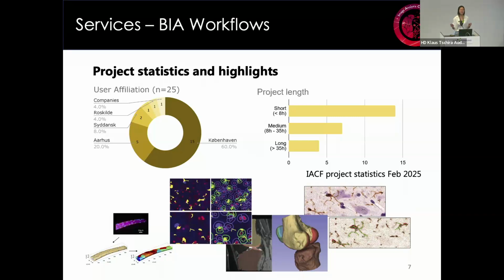So we find that somewhere in between is where we can actually provide image analysis as a service quite meaningfully. So that's things like tricky data sets where your out-of-the-box solutions just don't work for you, and you have to do a bit of fine-tuning for your specific data.